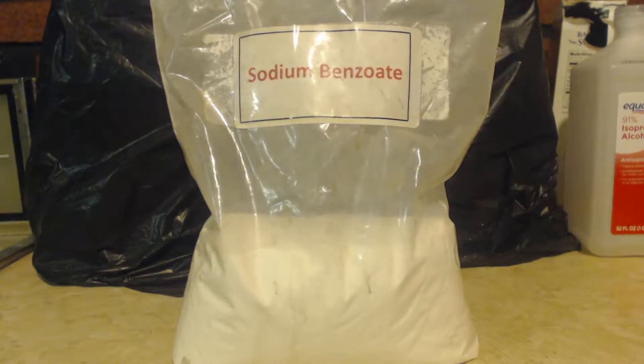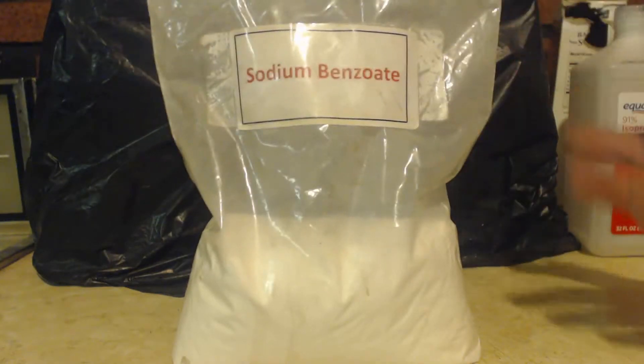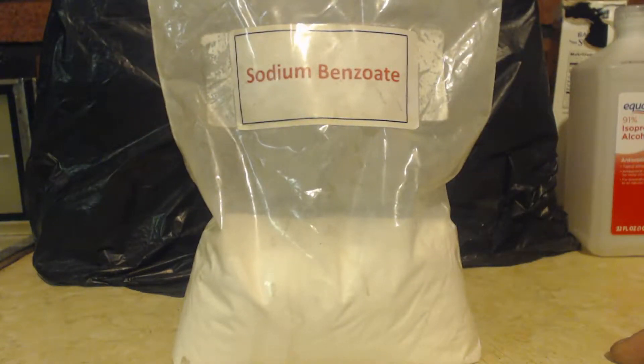This is John Block, super chemist. Nice easy video today — just how to get sodium benzoate. Sodium benzoate is something you can't really buy at the store, or maybe you can if you go to like a canning store or a health store. I just get it from eBay. This is a palm bag here — no big deal buying it.